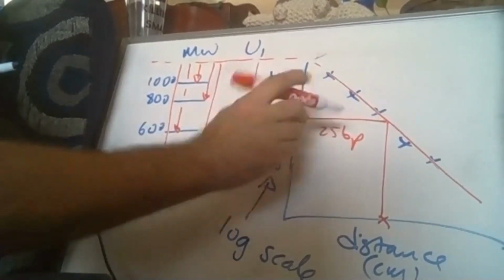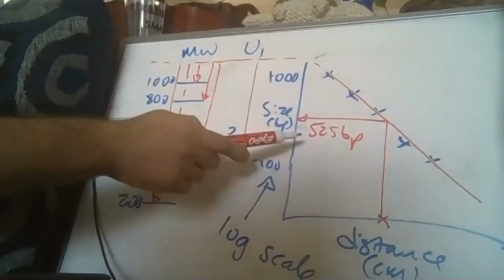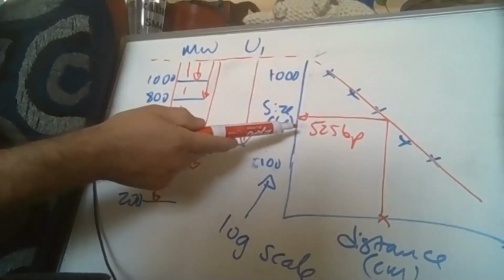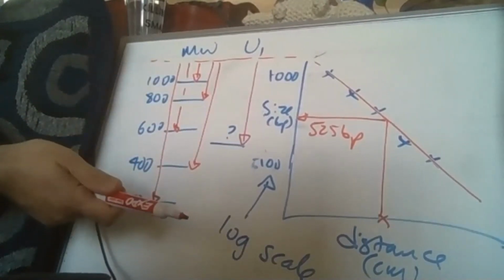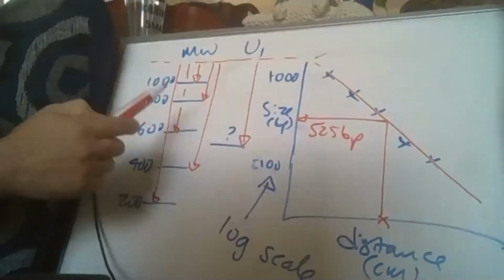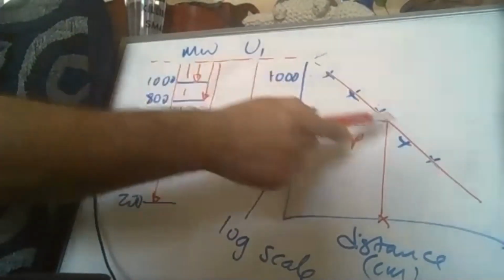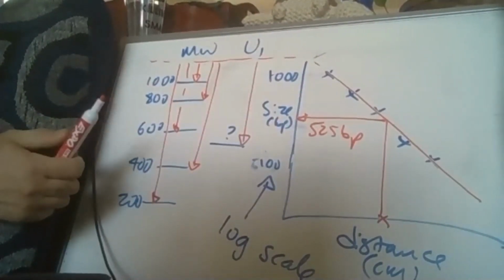Whatever it says on the scale, which is going to be better than my hand-drawn one, that's your actual size, or your calculated size, based on the line that you drew with this marker. Now, obviously, if you did this again with a different marker, then you may end up with a slightly different line and a slightly different calculated size.